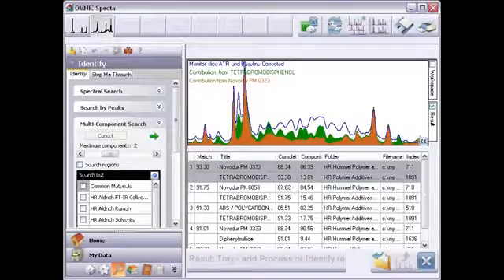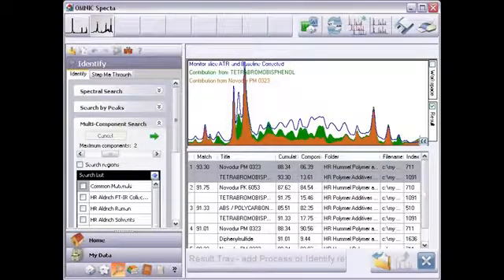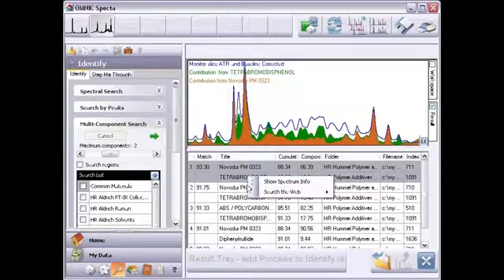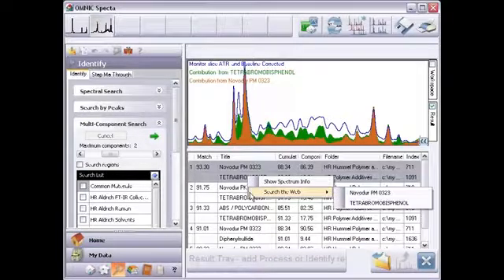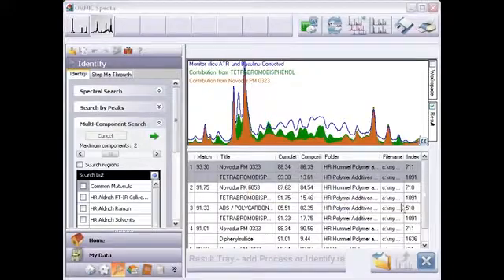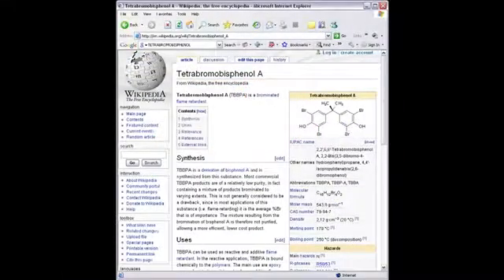To conclude, the first component is my base plastic. But what is the second one? If I right-click here and choose Search the Web, and then select the second component, the web search identifies it as a brominated flame retardant and a regulated material.